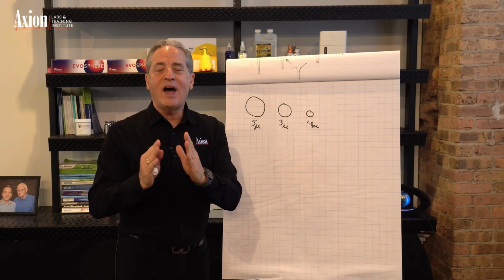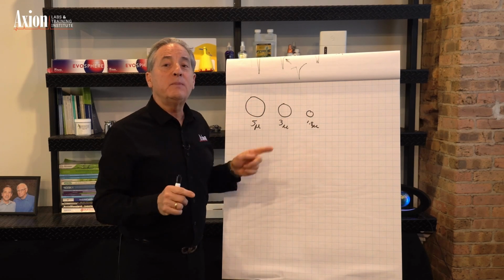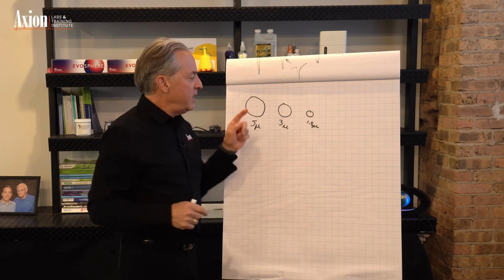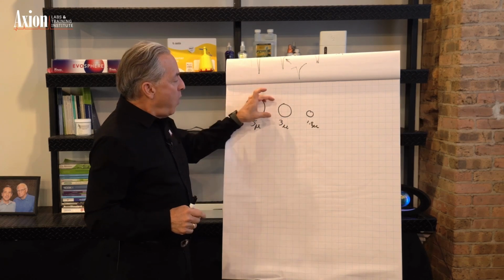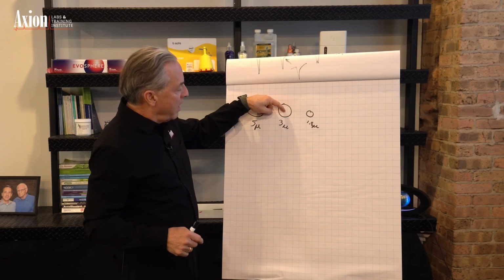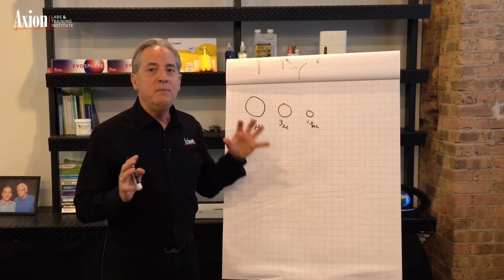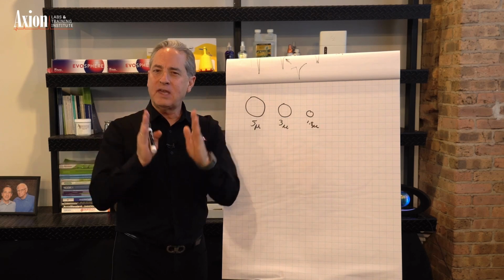I can't dictate what to do. They don't listen to me. I say, don't go too far in. They don't listen to me, but I can limit their choices. So go to a 3 micron, wow, there's a lot fewer choices. Molecules can go in 1 micron or 2 micron or 3 micron. They can't go in 4 because they've already gone over the side. So immediately my peak gets skinnier.